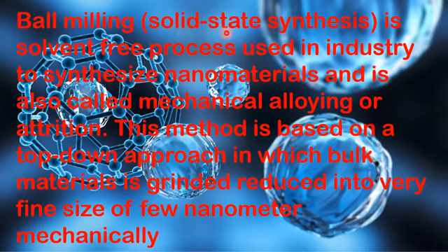So this method basically crushes a solid material and converts it mechanically into a very small fine nano powder.